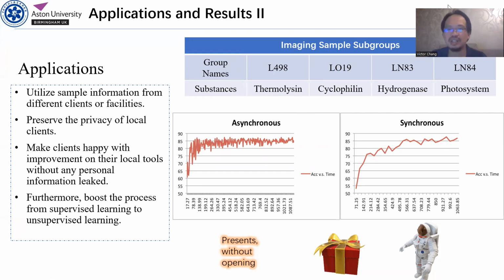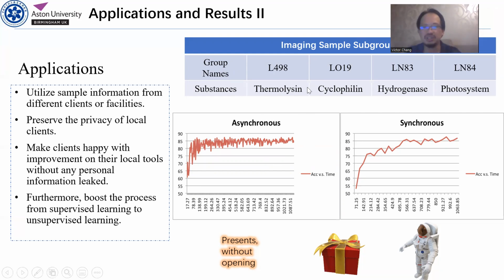These are the things that you may see in other scientific research. So there are different instances we can see. Then we perform those scientific experiments with both synchronous and asynchronous training. Under the asynchronous circumstances, looking at accuracy versus time, at the very beginning it picks up the accuracy between 70 plus to 80 plus, and then around 85% plus, like above.